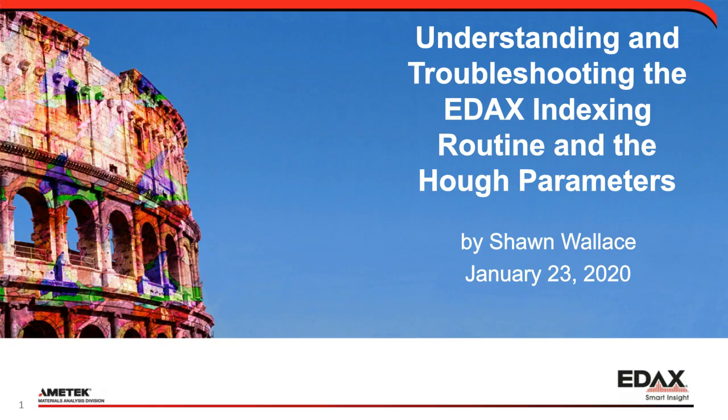Hello, everybody, and thank you for attending today's webinar titled Understanding and Troubleshooting the EDAX Indexing Routine and the Hough Parameters.